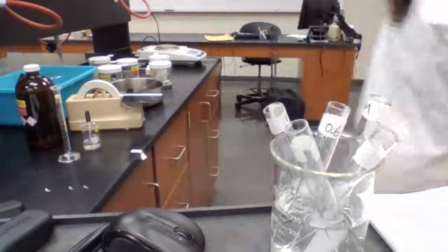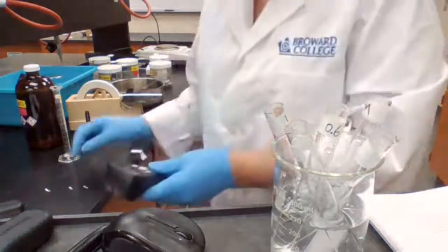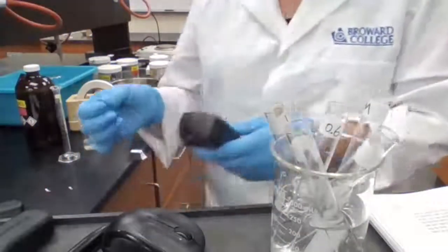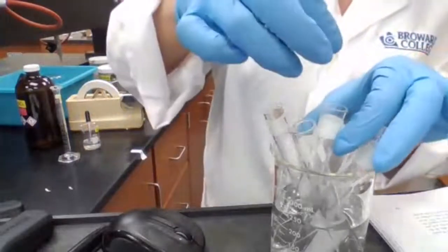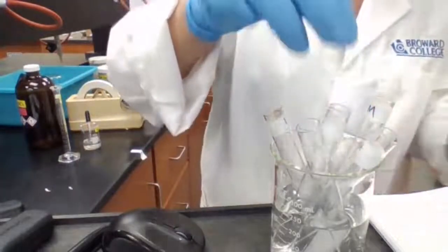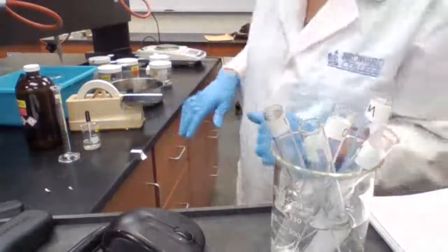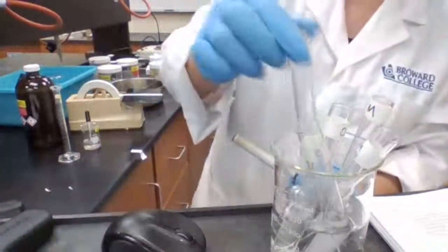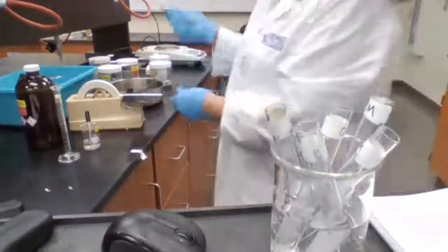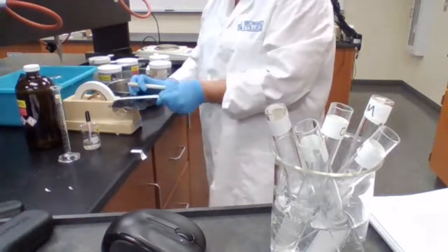If I find another timer, I can start at 0.6. Wow, they were generous. They gave me more timers. So to 0.6, I'm adding a piece of magnesium and starting. Before I get confused, I like to keep track, so I'm going to label my timers.